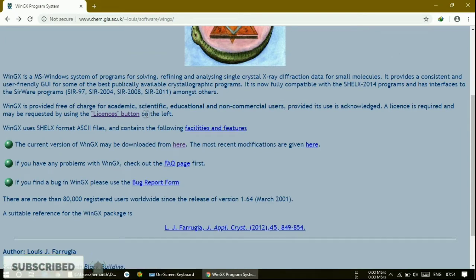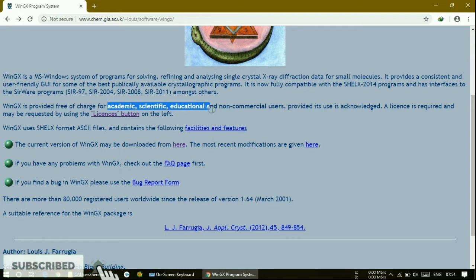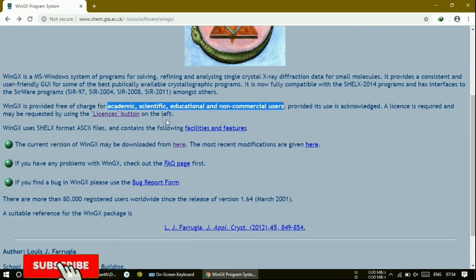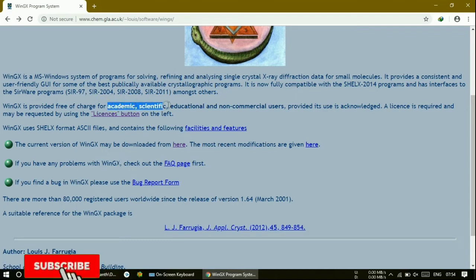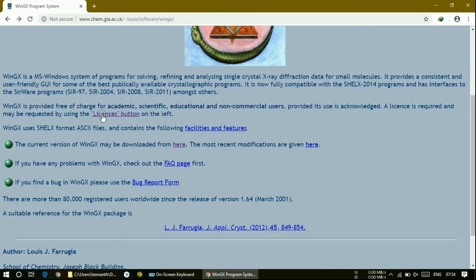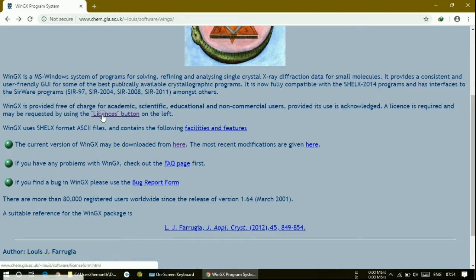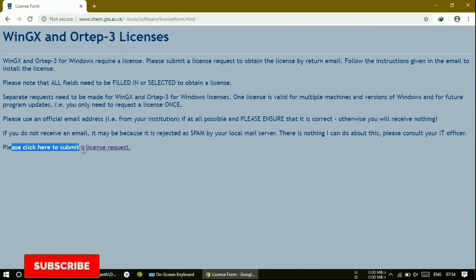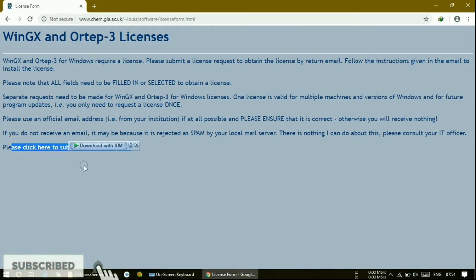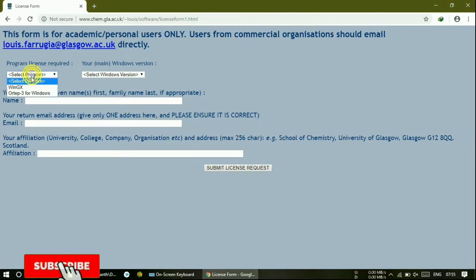Before downloading, you must get the license from them. This is free of cost for academic, scientific, educational, and non-commercial users. So for academic purposes, you can download it free of cost. We must get the license. If you are working in any college or university, it is free of cost for you. Just click on the license button here.